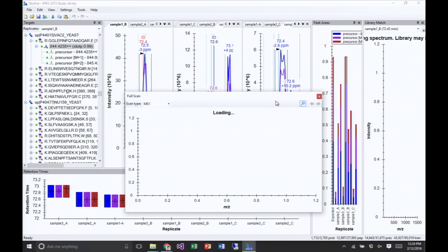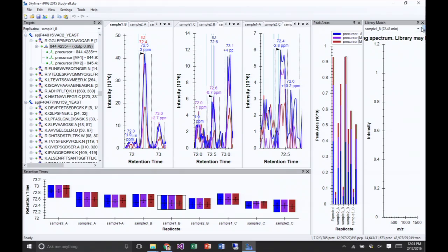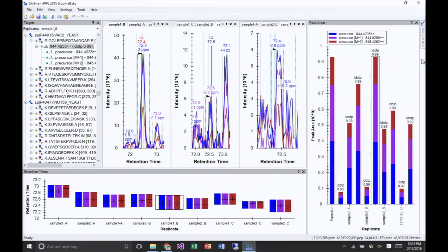We have a reduced amount of information we can look at. So let's close that. I could edit again, right? Could add the raw files. If we had the raw files and I could point you at them, they are up on Chorus. You could download them into the folder with this Sky file, and then all of a sudden you would be able to click it. So all you have to do is get the raw files back into the folder with the Sky file, and then you can look at those. Similarly, if you have the redundant library, you could put that in there too.